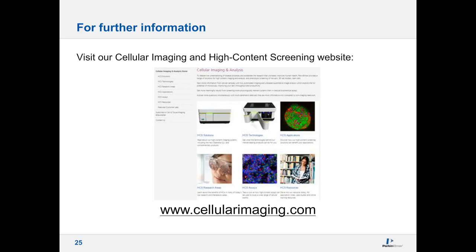This depth can be improved upon by clearing the microtissues if it's an endpoint assay, in which case we typically can double the depth that you can still analyze, or if you predominantly need to work with microtissues, you're also free to use an Opera Phoenix instead, which has a larger pinhole-to-pinhole distance, which also translates into a deeper depth of analysis in these tissues, which is typically then in the range of roughly 100 micrometers for a typical type of tissue.